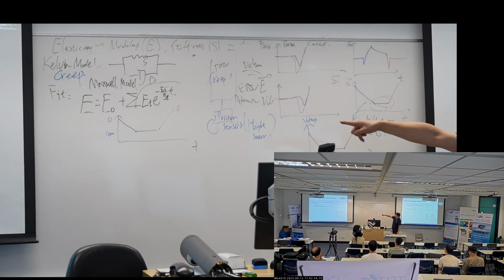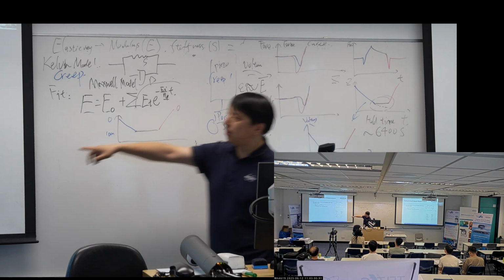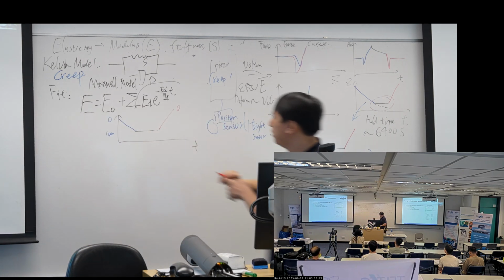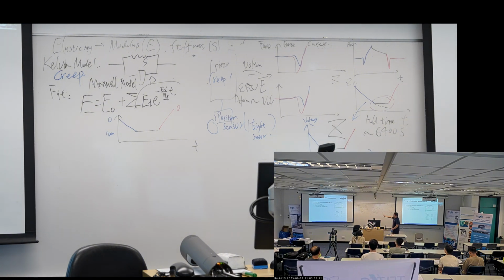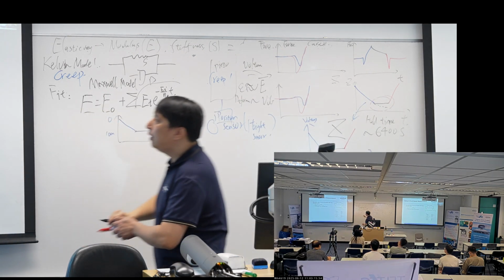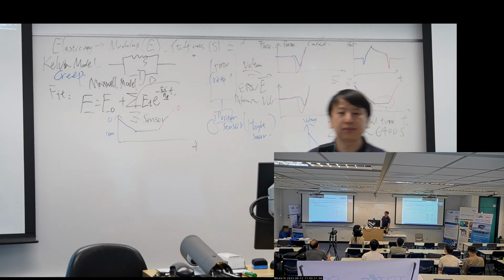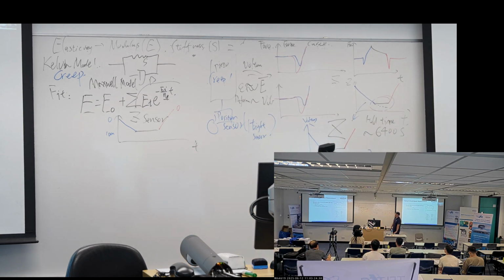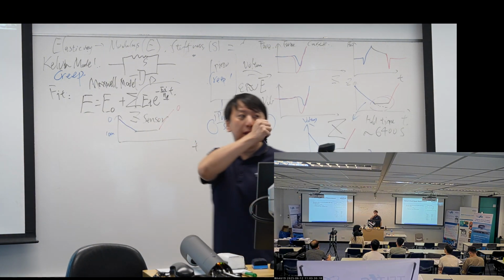So our AFM instrument provides two options for the users. If you want to control voltage, the hold type in the software here is we hold Z. If I really want to control the height, the hold type here is we hold the Z sensor. So in the afternoon, in the hands-on session, you can try both.